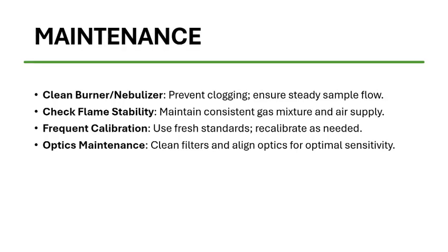Coming on to the maintenance. Clean the burner and nebulizer to prevent clogs. Check flame stability and recalibrate frequently. Maintain the optics by cleaning filters and aligning components regularly.